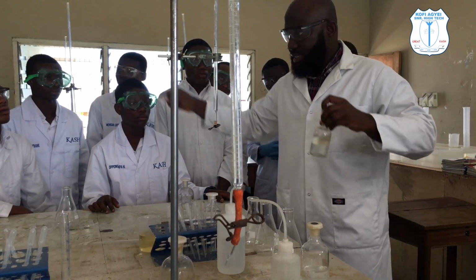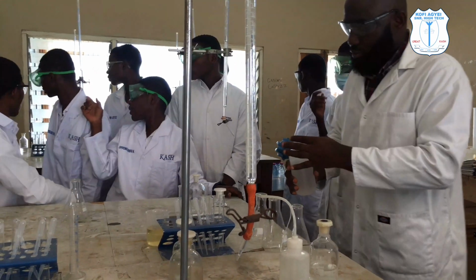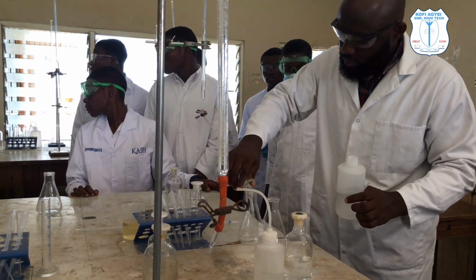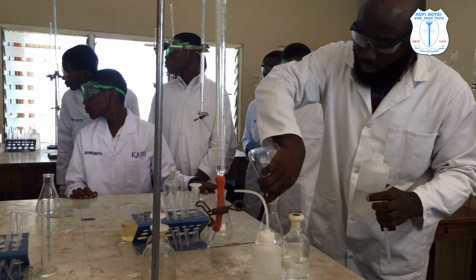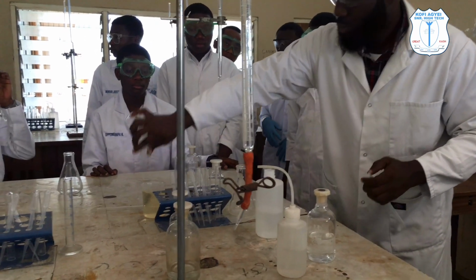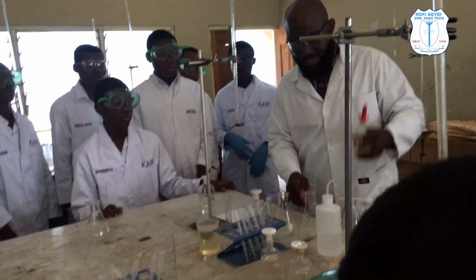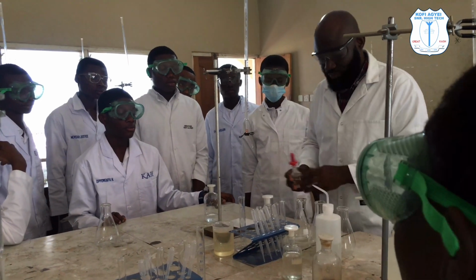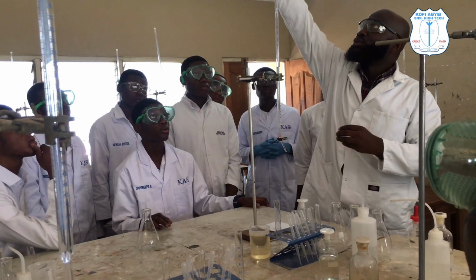Now there's a phenolphthalein indicator in the cupboard. Please let me have that one. So the same thing, phenolphthalein indicator. As I said, with the methyl orange, you do it how many times? 3 times. Now the phenolphthalein, the same thing. So here the same thing. This one is the acid. You're going to add the acid gently.